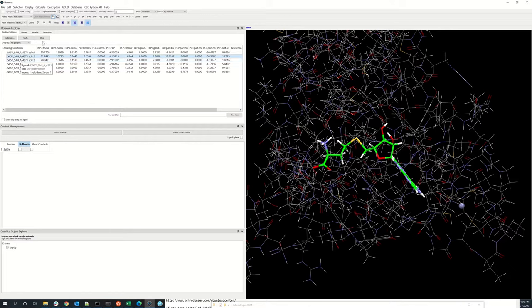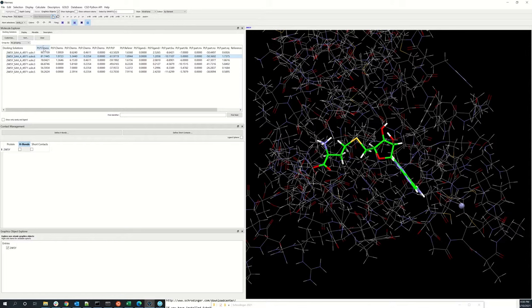Then you have the fitness score associated with your docked solution, and you can click on it and it will rank the solutions based on the score. The best solution found by GOLD will have the highest fitness score.